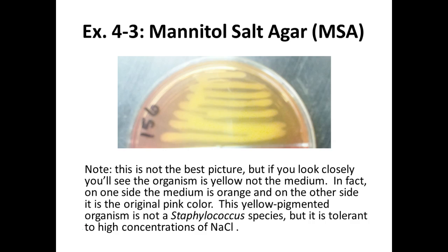So, does anybody have a plate like that? That they have growth on the mannitol salt for their organism? I know it might be Jade's plate that she's out. Is it 108? Okay. Yeah, that one's getting a little yellow around it, but that one is not. That's not a staph, right? And again, I think it's due to the age of the plate, and maybe over time that one might ferment. I don't know. That's not an organism that we would deal with in a clinical lab. It's a bacillus. It's one from soil. It's a soil contaminant.